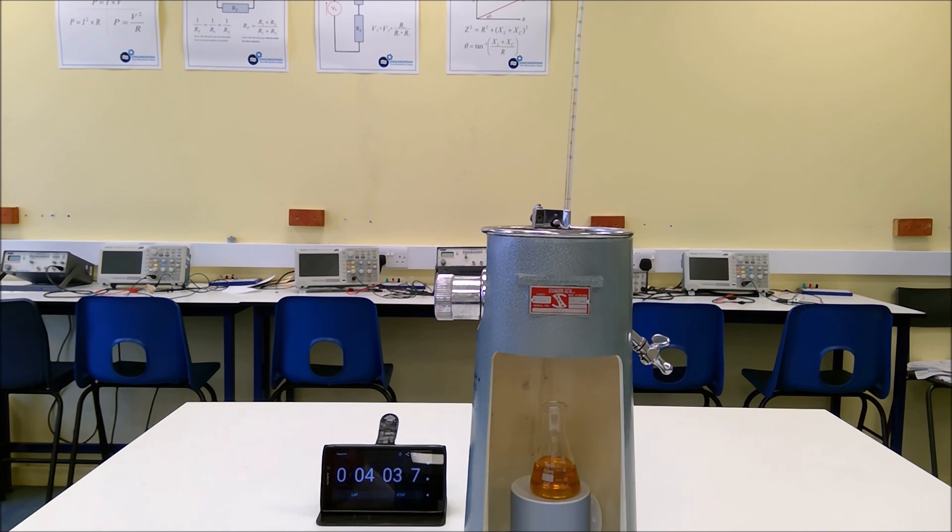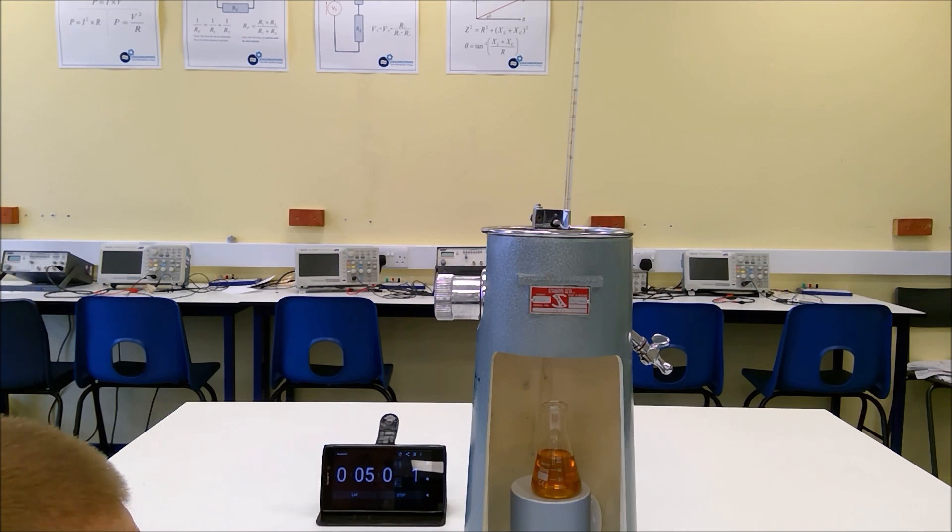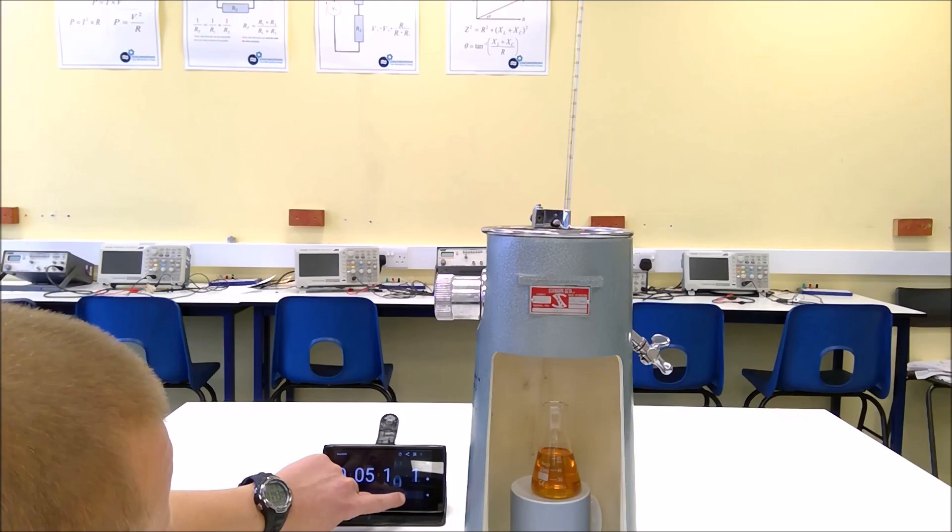Now we're at 40 millilitres, and it's important to point out that what we need to use as our reference is the bottom of the meniscus — the bottom curve of the fluid. As we get close I need to get my eye line in line with the index mark, and there we are at the bottom of the meniscus.